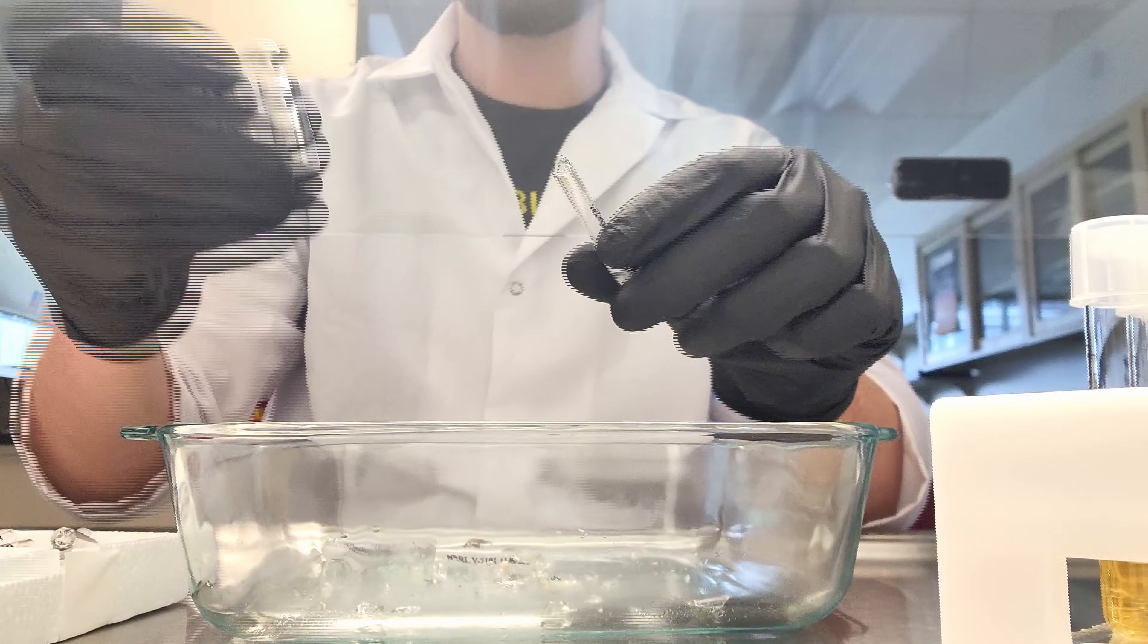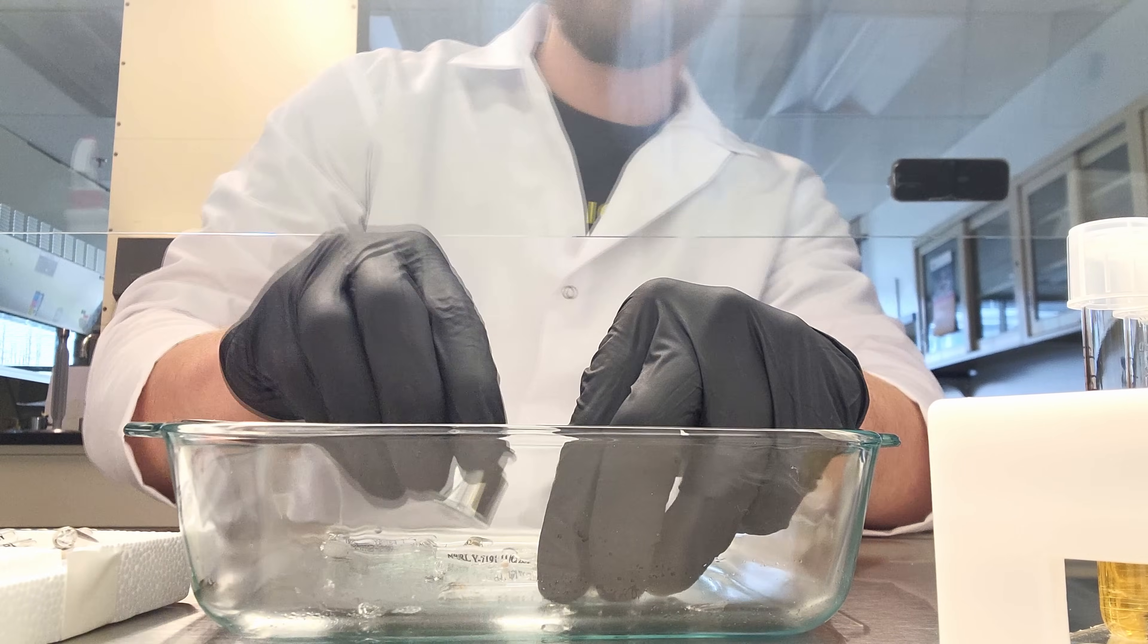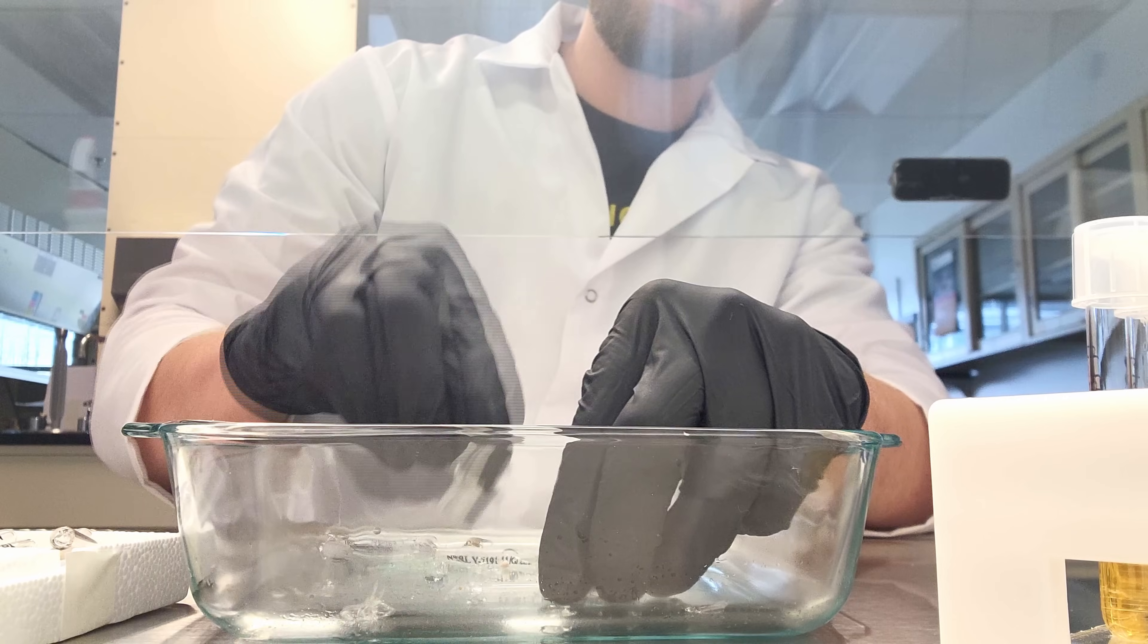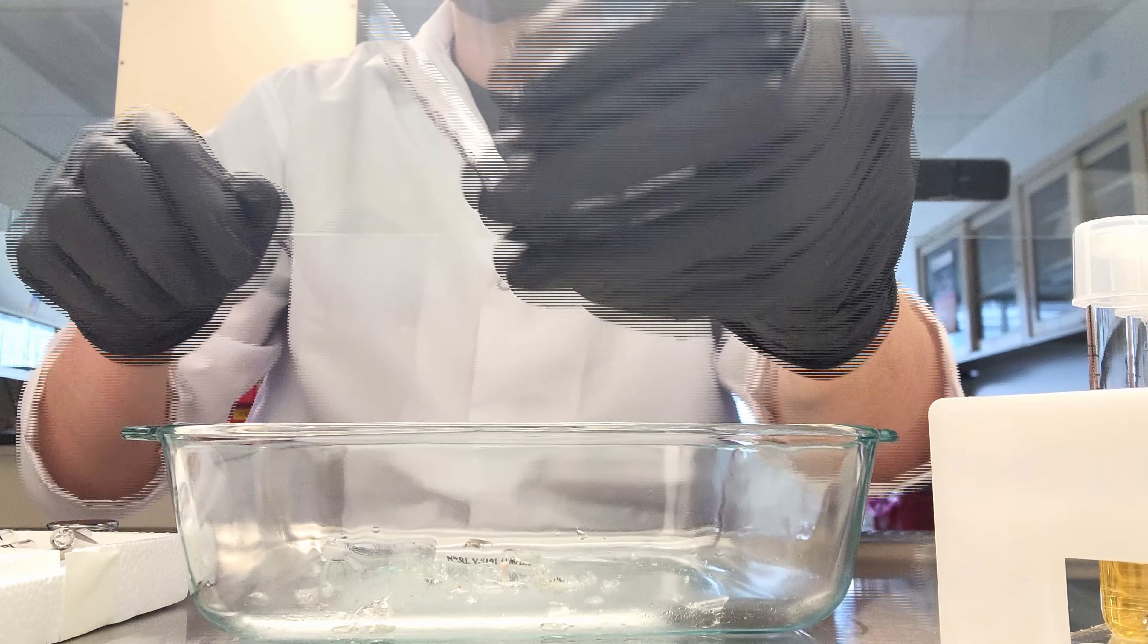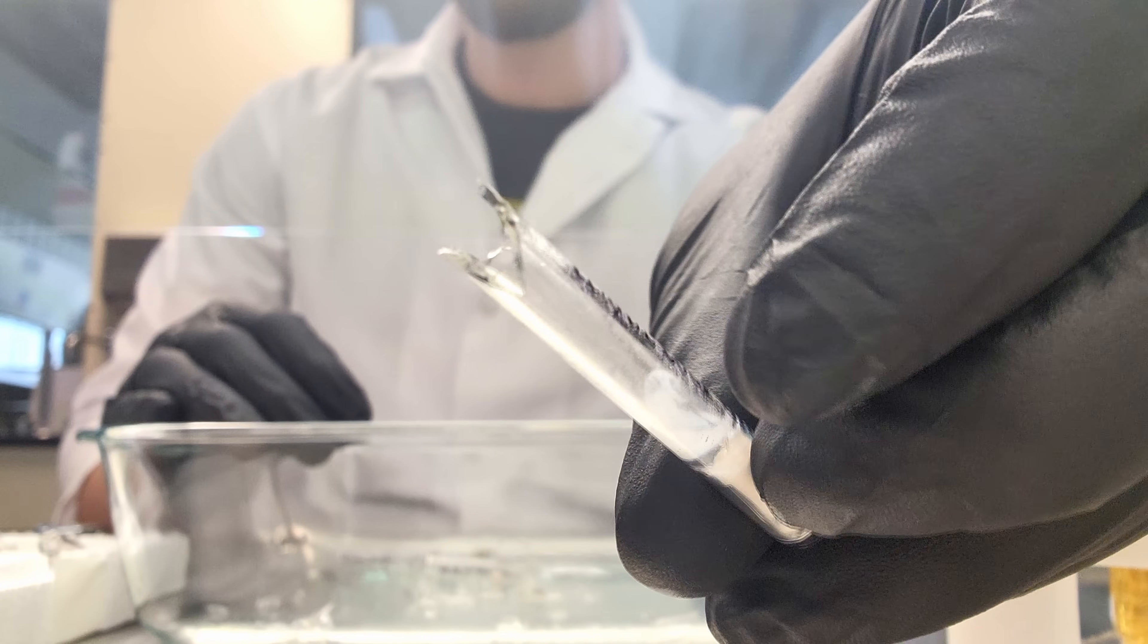I've got a heavy object and I'm just going to smash the glass ampule. There are more civilized ways of doing this, but this has worked great for me for a long time.